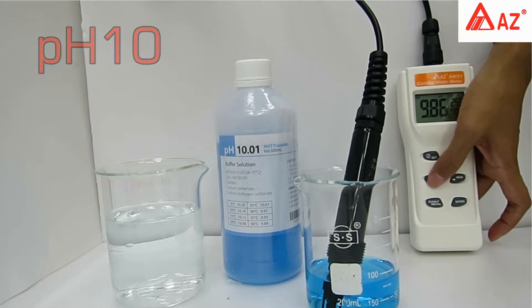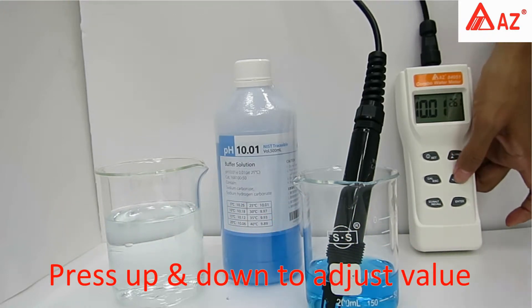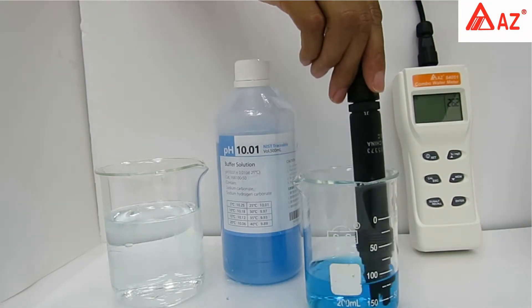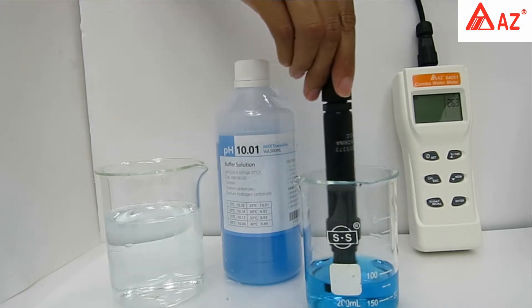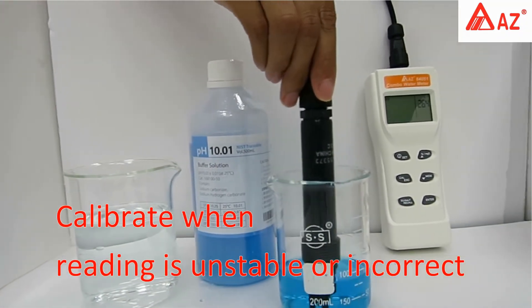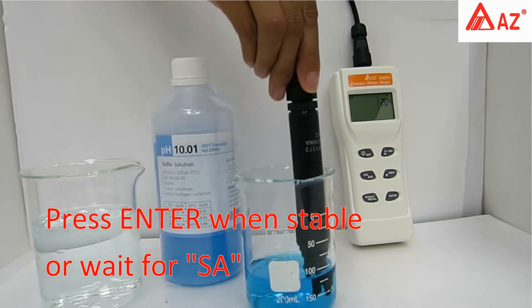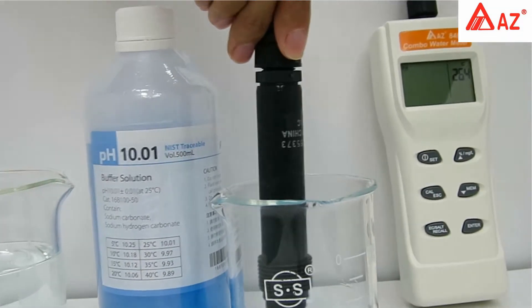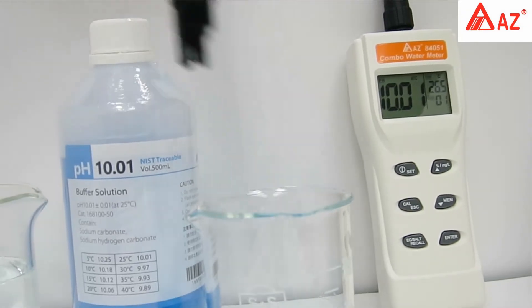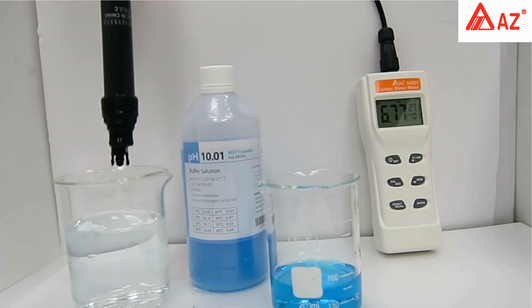For pH 10 calibration: long-press Cal to enter calibration and set the standard value using the up and down keys. Use a transparent container with the electrode fully immersed in buffer; stir gently for a homogeneous condition. Do not reuse standard buffer. Once the reading is stabilized, press Enter or wait for auto-save. Rinse probe with deionized water, dry the glass bulb, and replace the storage cap.